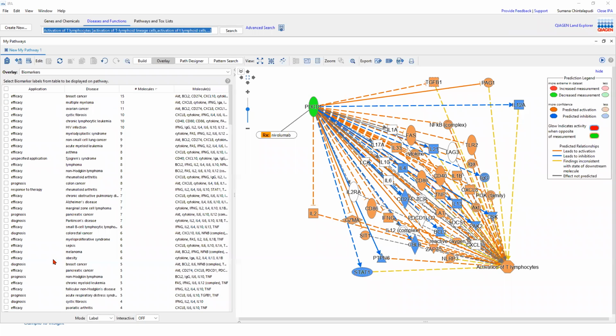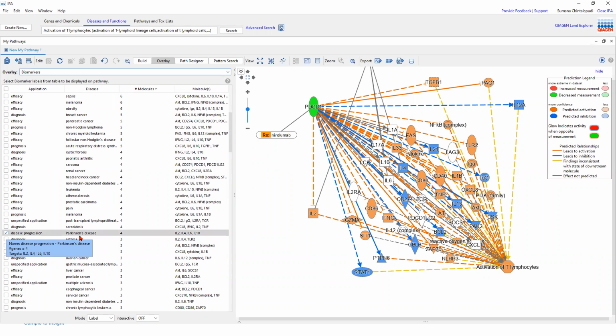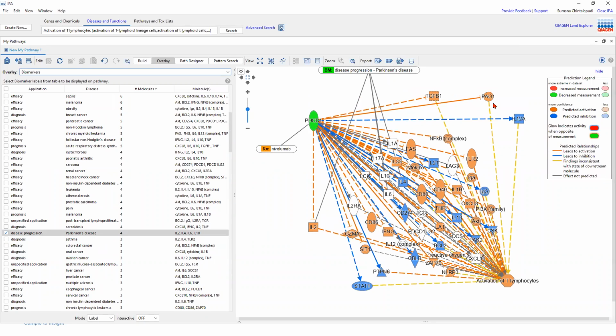So you can easily find the relevant information. For example, here you can see some of the markers were utilized for Parkinson's disease. So that's a unique new information. If you're working in the neuroscience area or neurological diseases, this is very unique information that you can identify. So you can add this as a tag.